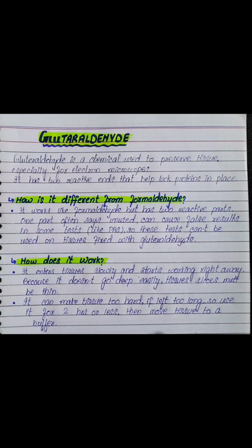So the next fixative is gluteraldehyde. In the previous lecture we discussed picric acid and its function, and how we can use it in the histopathology lab. The next one is gluteraldehyde. So in this video lecture we will discuss briefly the gluteraldehyde fixative, so that we can decide whether we have to use it in our laboratory or not.